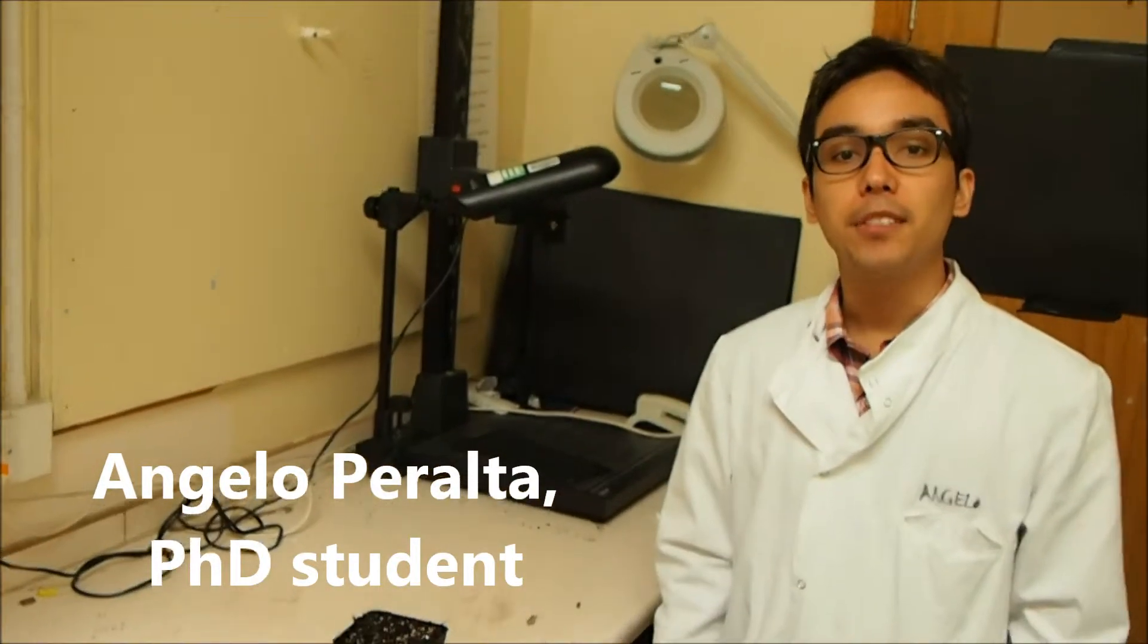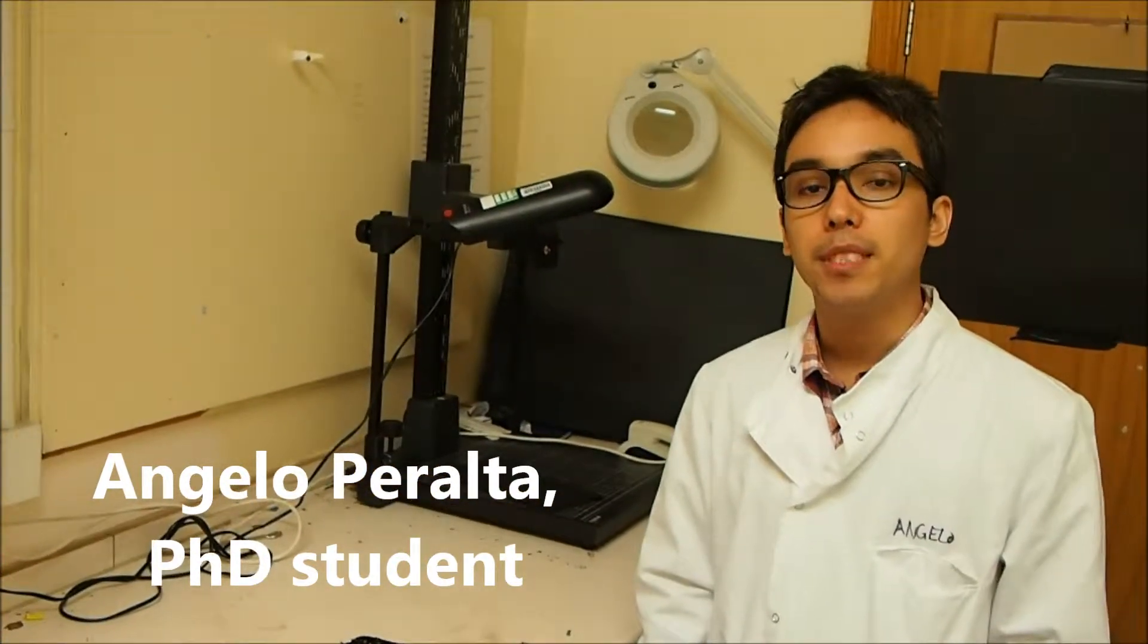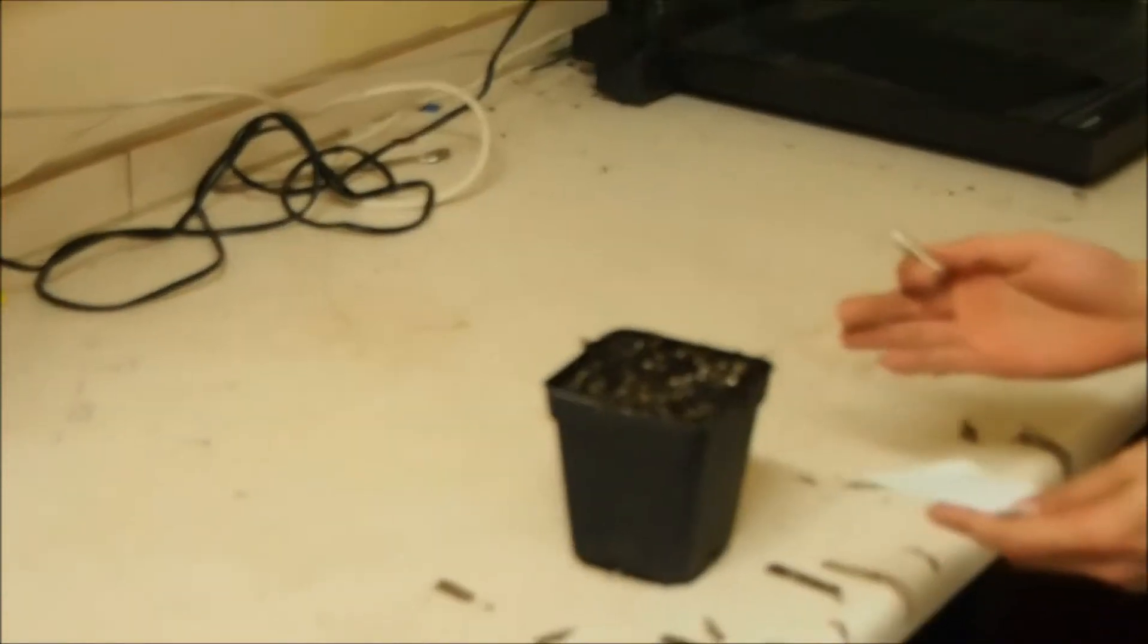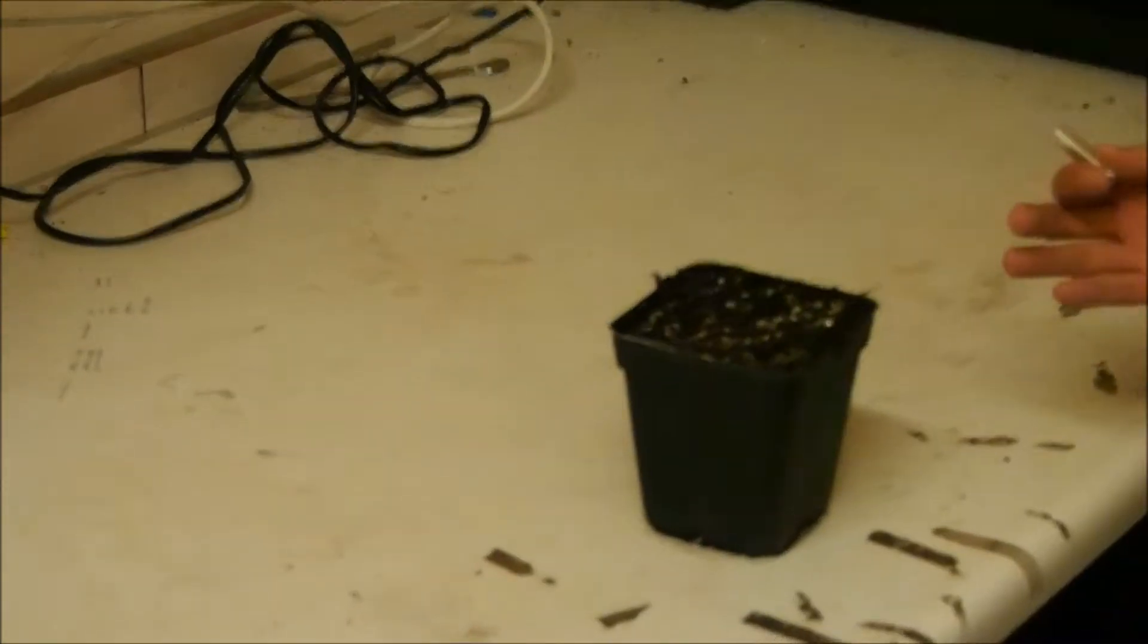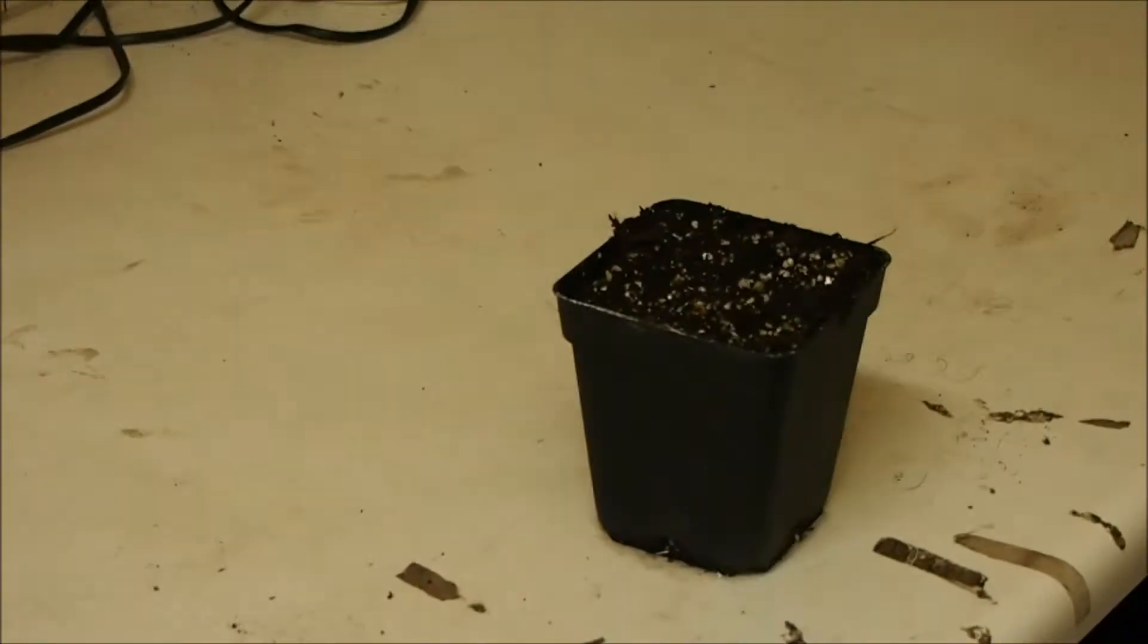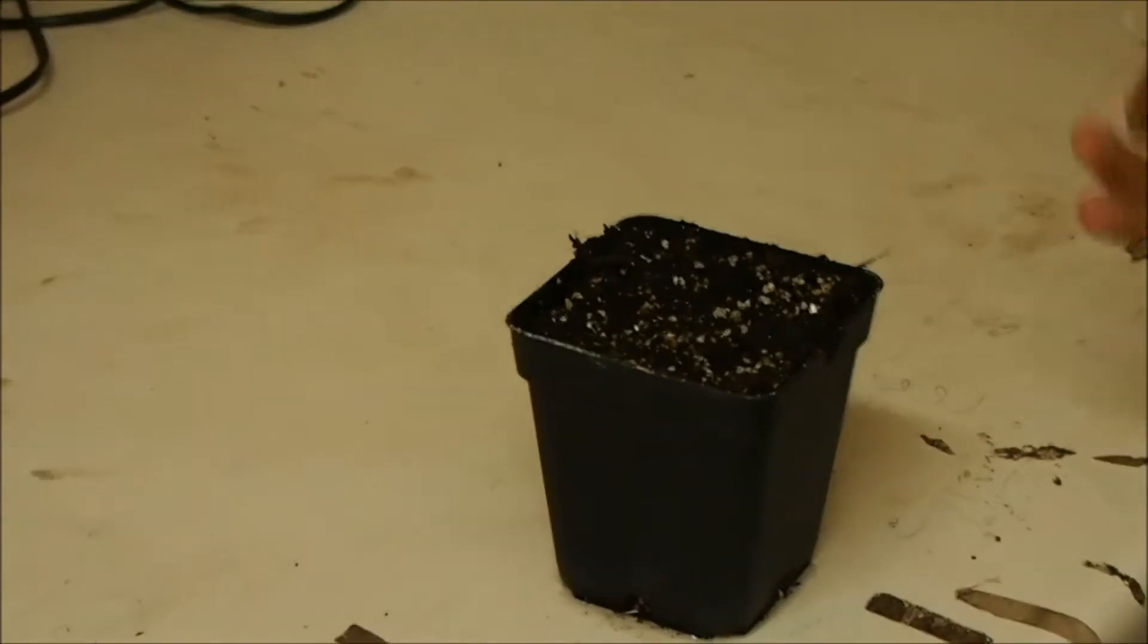Hello, I'm here to show you how to plant some Arabidopsis seeds. We have a pot here with some compost that's been already watered a bit, just so that it's wet and the seeds already have some moisture to be able to germinate.